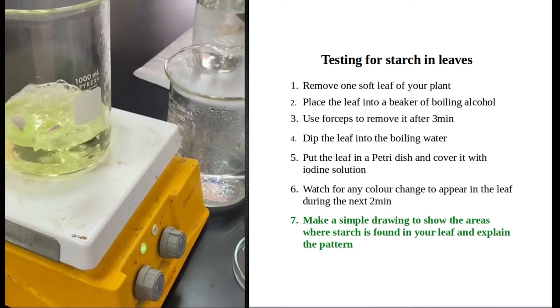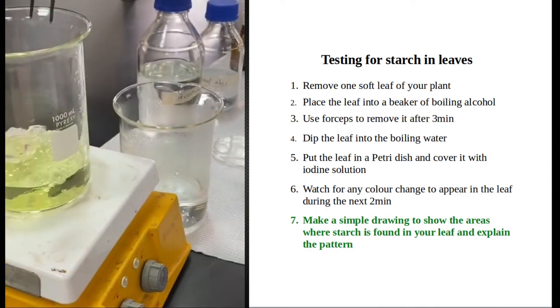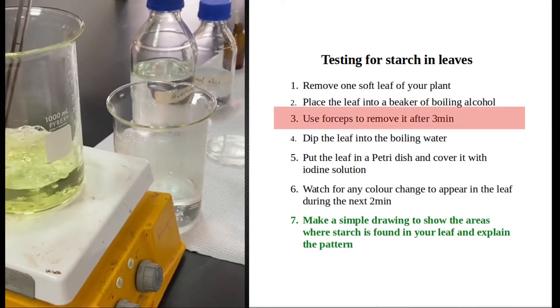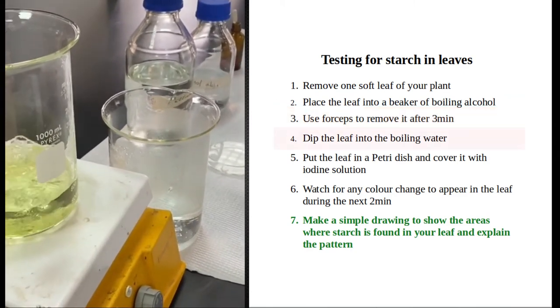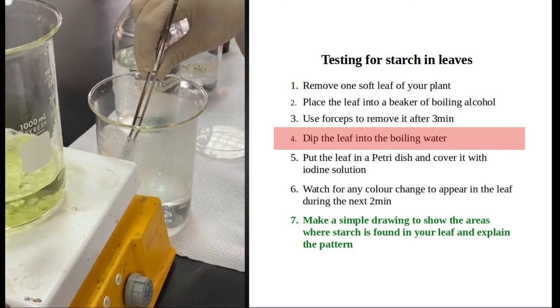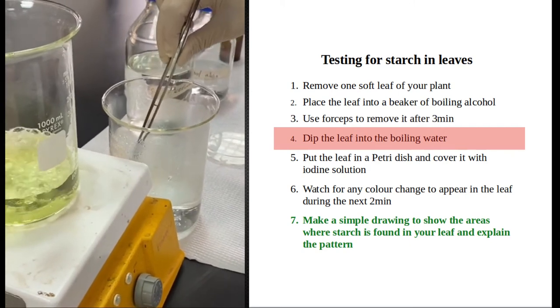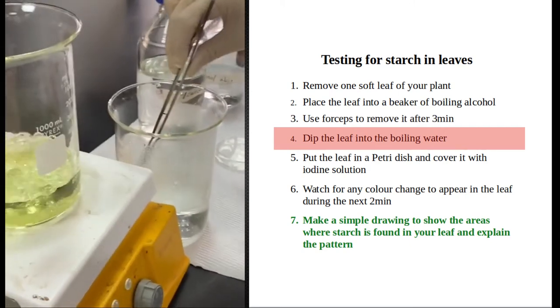The leaves have lost their colors. I will pick them up, put them quickly in hot water to give them some flexibility, and transfer them directly to the glass petri dish.